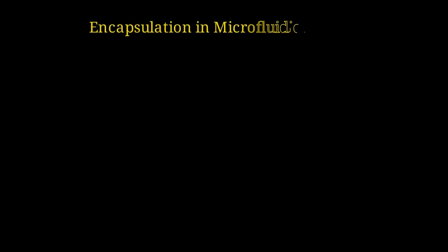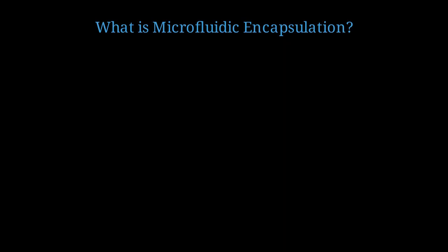Welcome to this scientific lecture on encapsulation in microfluidic devices. Today we're going to explore how we can trap materials inside tiny droplets or capsules using the principles of fluid dynamics at the microscale. Let me start by explaining what we mean by microfluidic encapsulation.